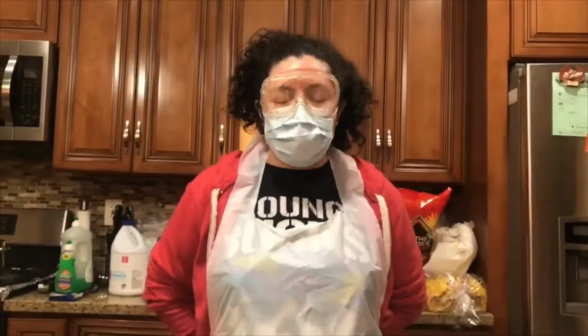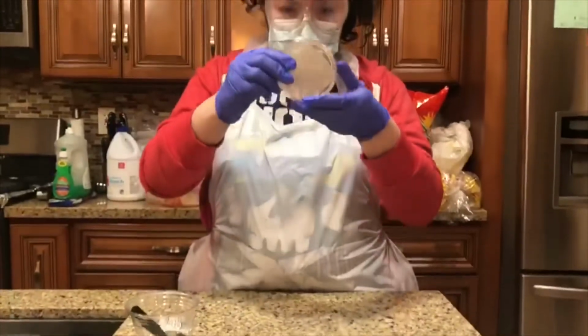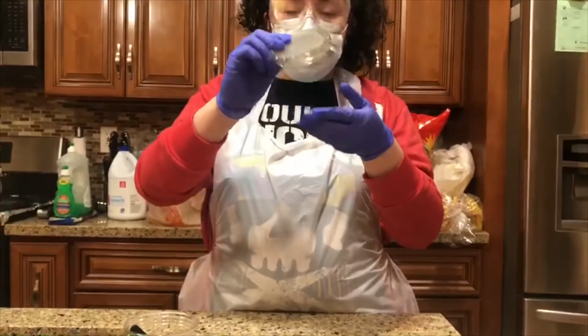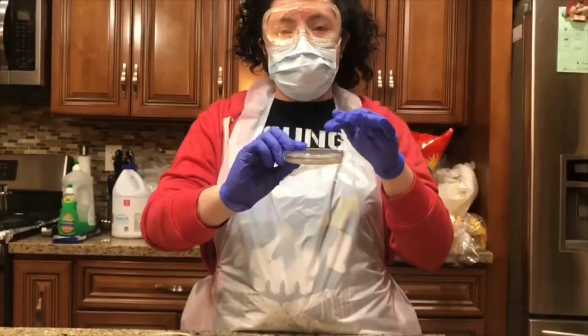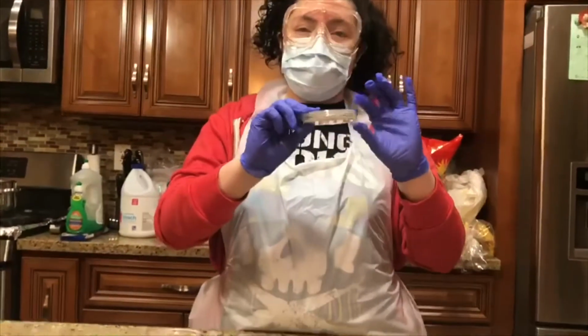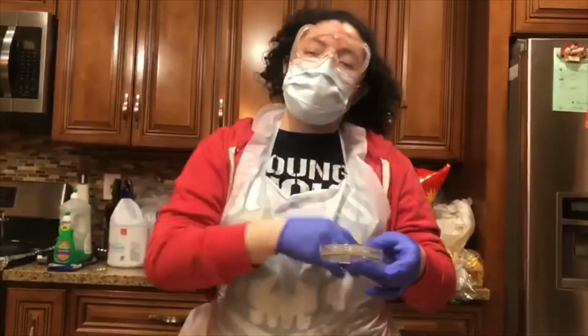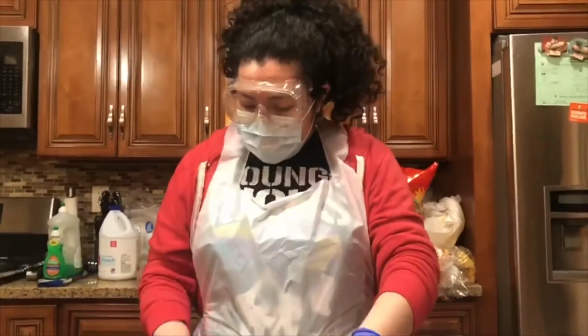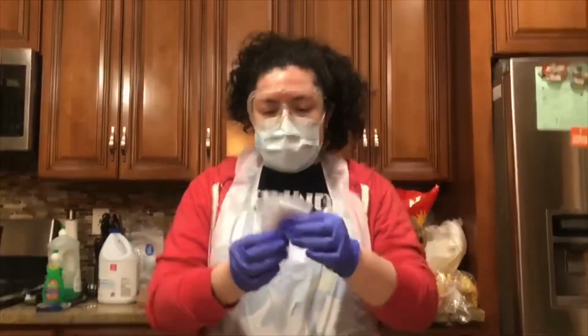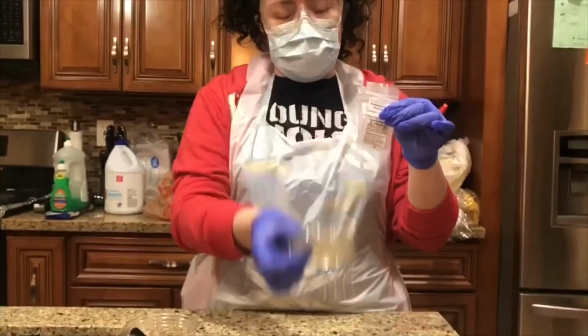I'm just finishing the part of the preparation. So as you can see, here's my agar, and I actually looked at it, and the microbe, the S. epidermidis that I spread out evenly throughout the agar plate has dried. I've waited approximately between 1 hour to 2 hours. So now I'm doing the rest part of the preparation, which is inputting these antibiotics in sterilely to its corresponding part of the agar plate, okay?